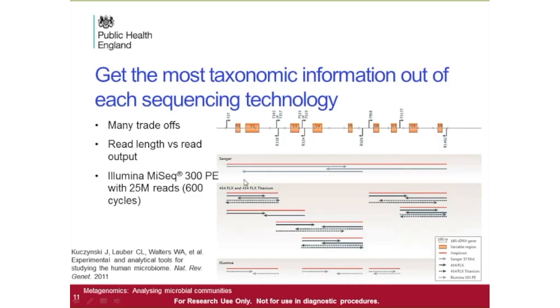and using either, for example, 454 FLX Titanium, or using Illumina MiSeq 300 paired-end reads, you would be able to get a similar set of resolution that would allow you to cover this variable region if you target, through 3 sets of amplicons, most of the variable region. And that would give an indication of the diversity within the sample and the taxonomical allocation more accurately.